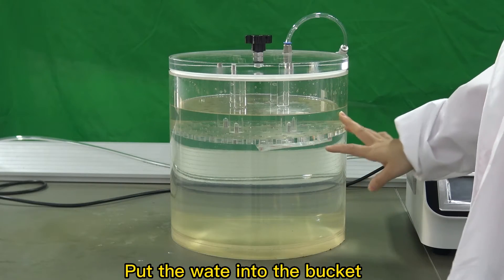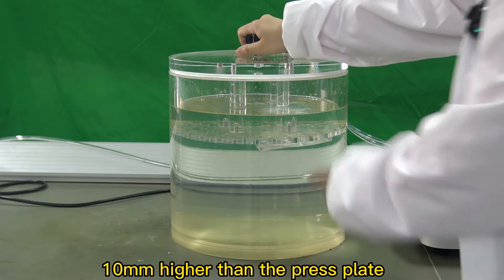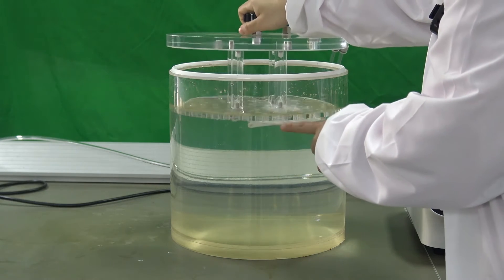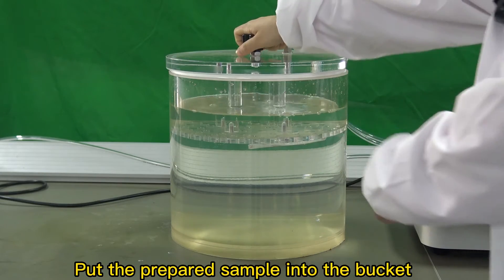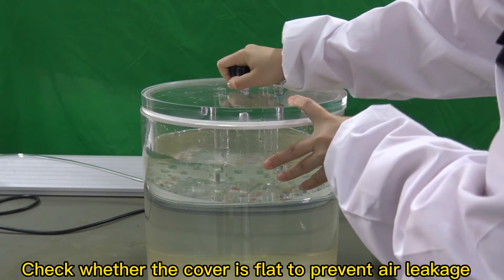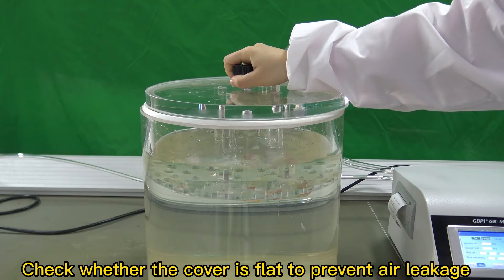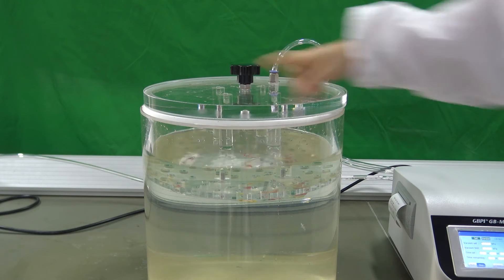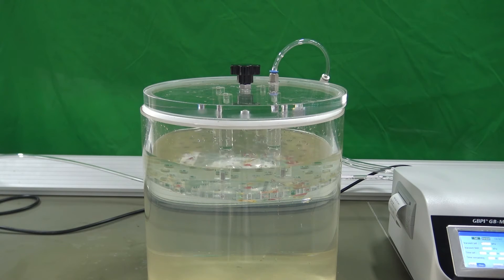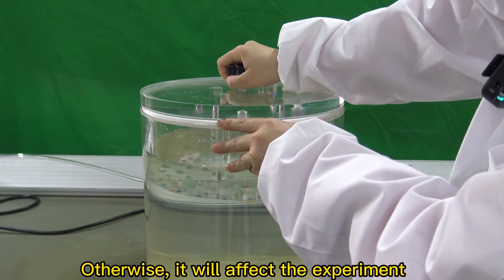Put the water into the bucket 10 millimeters higher than the press plate. Put the prepared sample into the bucket and check whether the cover is flat to prevent air leakage, otherwise it will affect the experiment.